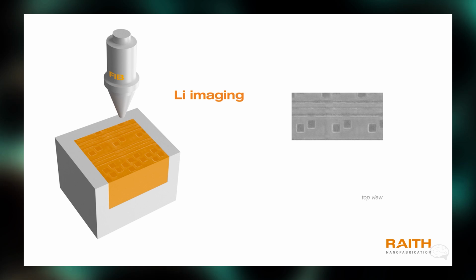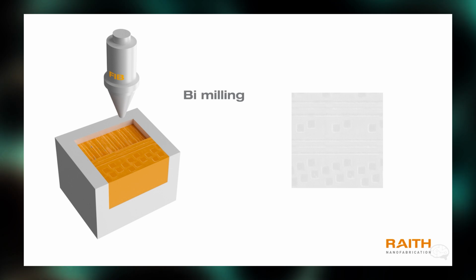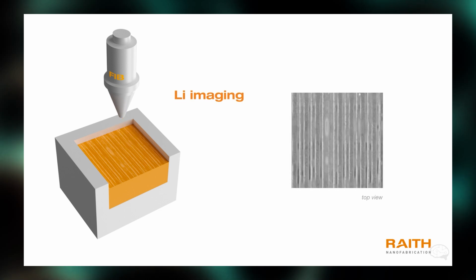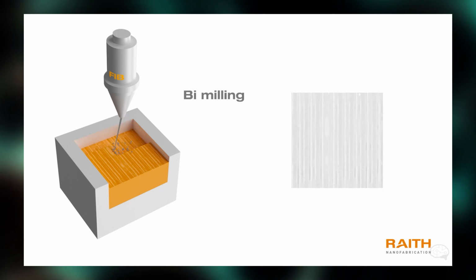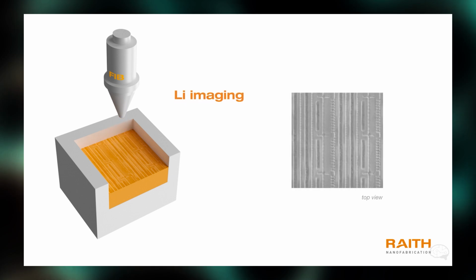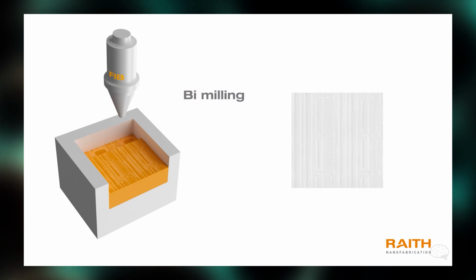And if it comes to analytics, we have got options regarding the primary ion beam. So we can use light ions like lithium, which is a very reactive ion, but we can also use heavy ions like bismuth or gold, depending on the source that you're going to use. And you can adapt the application according to your needs. So that's quite fancy. We have full nanofabrication capabilities with the different ion species. So it's a full nanofabrication tool with a laser interferometer stage for large area, stitching-free nanopatterning, which I think is very unique. Wow. Yeah. Okay.